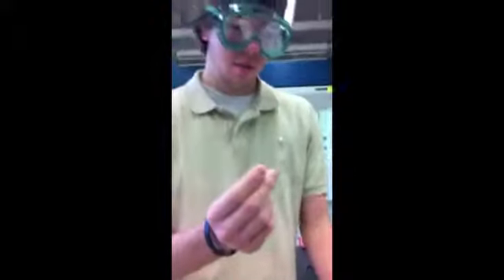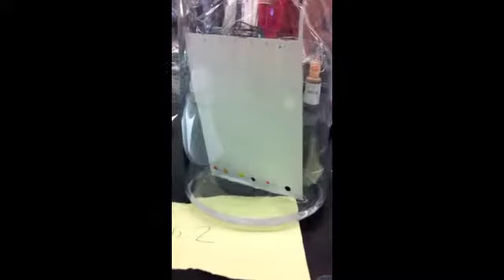Alright, I'm going to take the unknown sample and put it on my little card. I think I might have made a little bit too big of a dot, but that's okay because it'll still do what it needs to do. Now I'm going to place my card in my solvent, which is the 15-2, cover it, and let it sit for 10 to 15 minutes.